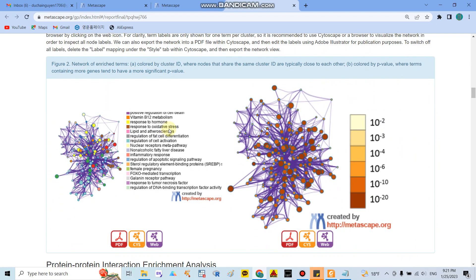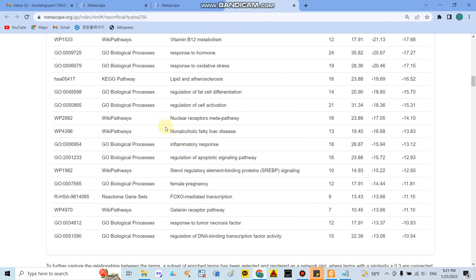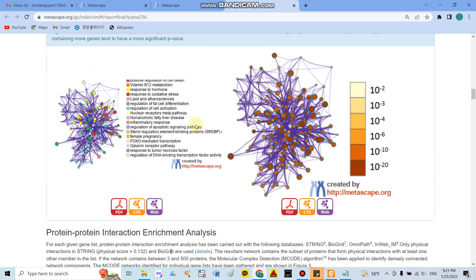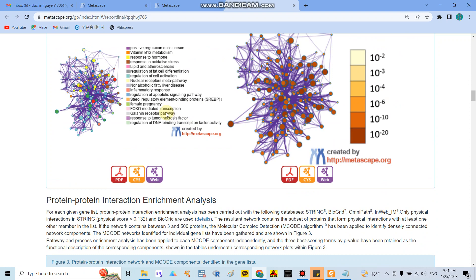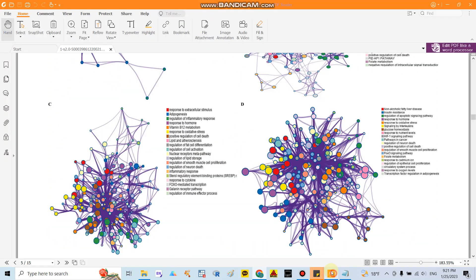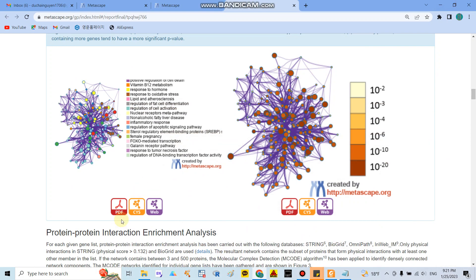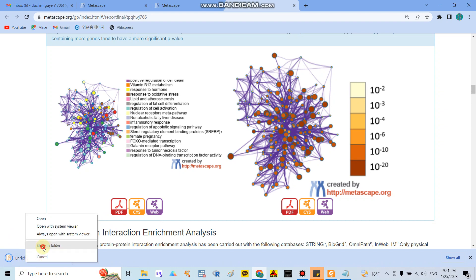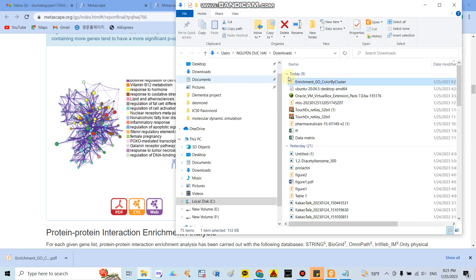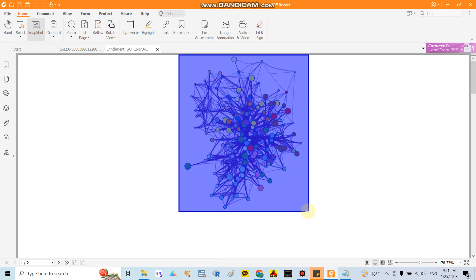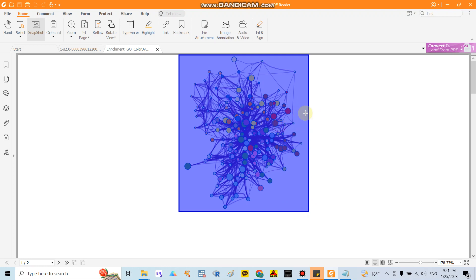Next I will show you if you don't like to publicly display the data in this table and you can select the figures as the same in my paper here. And you can only click the PDF here and you can right click and you can see in the folder and you can set up here you can save. And you can take this figure to your paper but you only copy and you can paste in the Word or PPT.